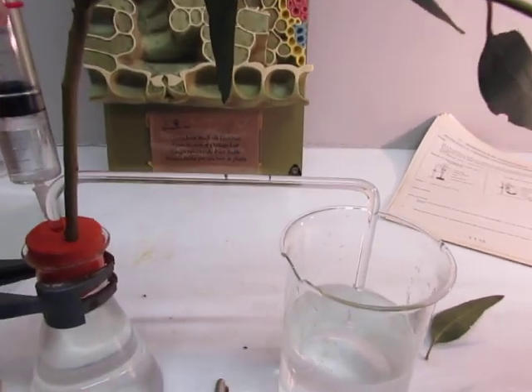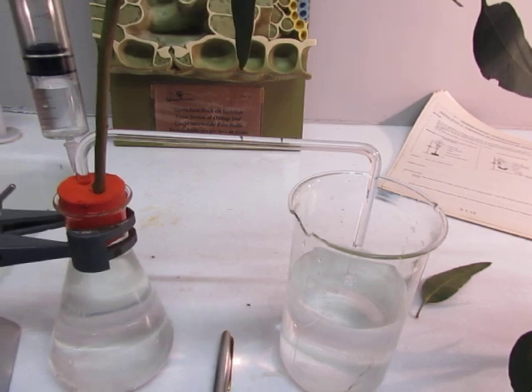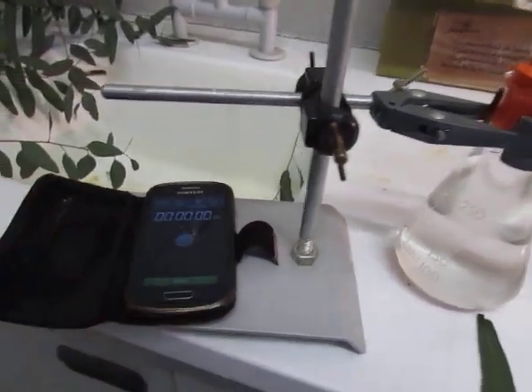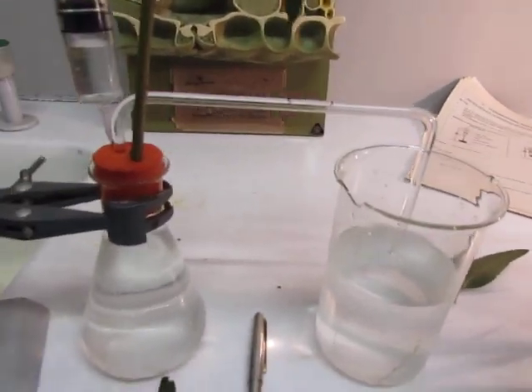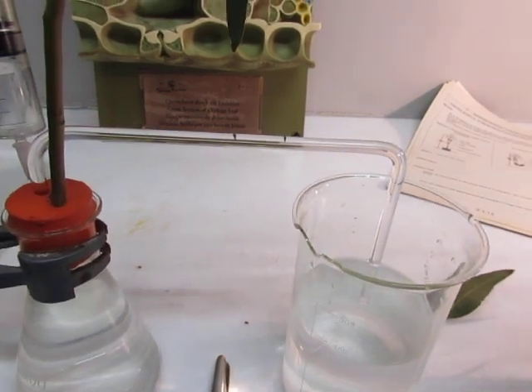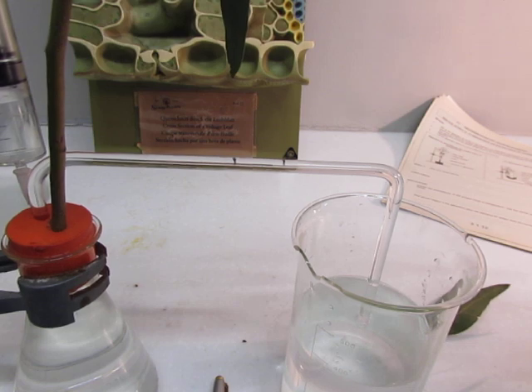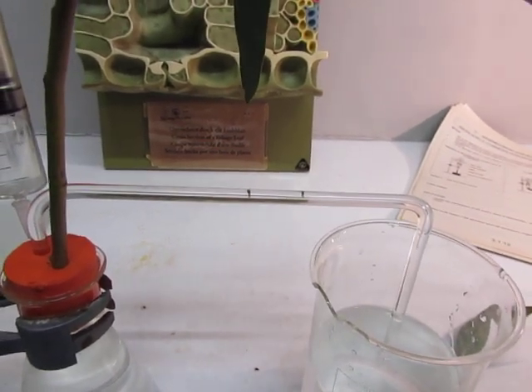Now you can see my air bubble has moved beyond the first mark on my capillary tube, and I need a stopwatch to do this. I'm going to use my cell phone stopwatch for this. The moment the air bubble touches the first mark on the capillary tube, I press the start button. And you can see it's moving rather rapidly there.